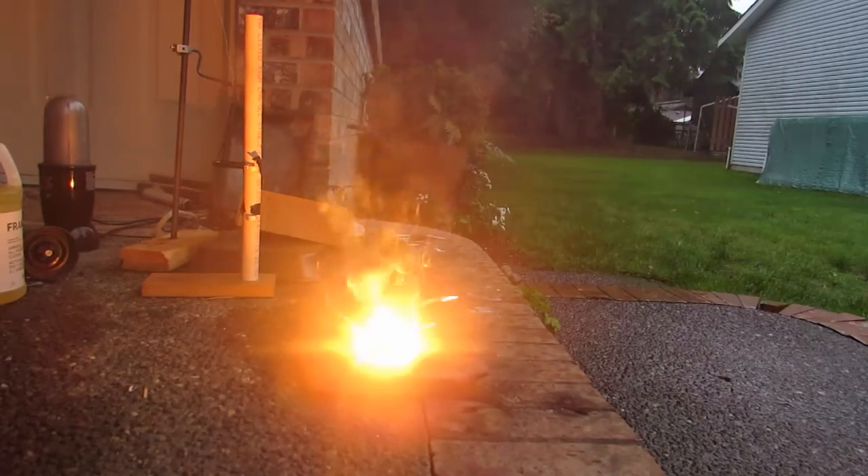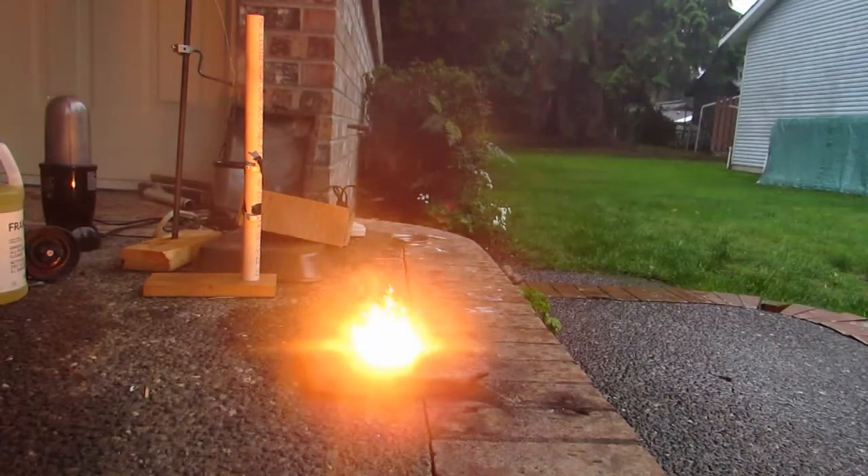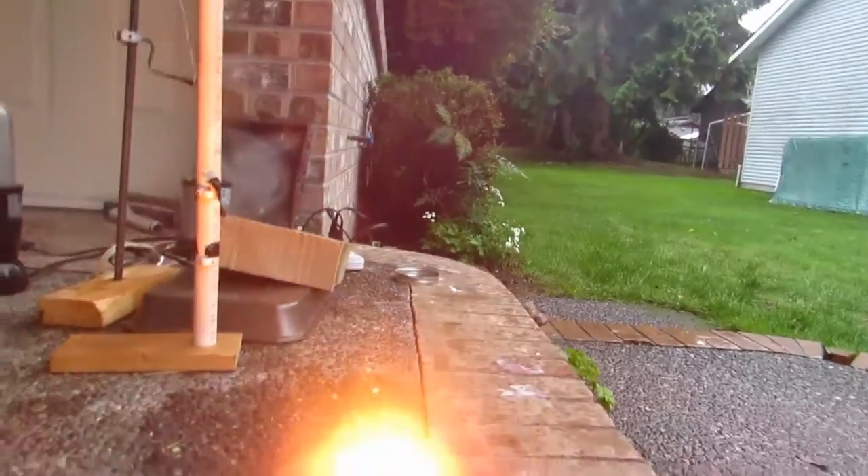It was done on a rock so that hopefully everything would be contained. And we have a beautiful bubbling mass, which you can see right here.